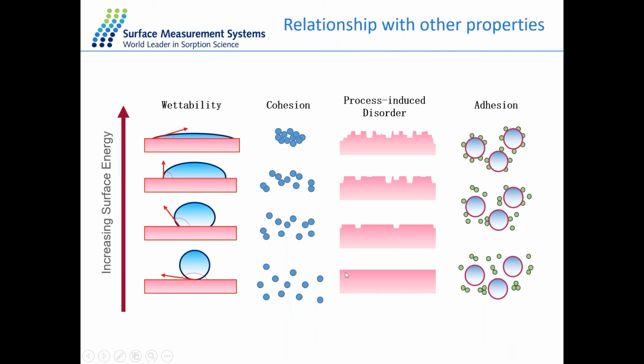And like I mentioned before, because we can inject in multiple concentrations across the surface, we can understand any kind of defects or porosity on the surface of the sample and get an idea of any disorder or heterogeneity occurring on the surface of the sample. We can also calculate work of adhesion. In this case, we're looking at two unlike materials, so you have a sample material and another material, and we can understand the compatibility and the interaction between these two samples.